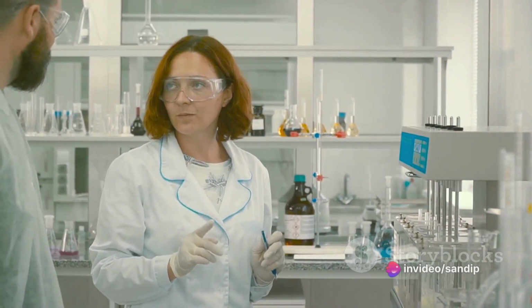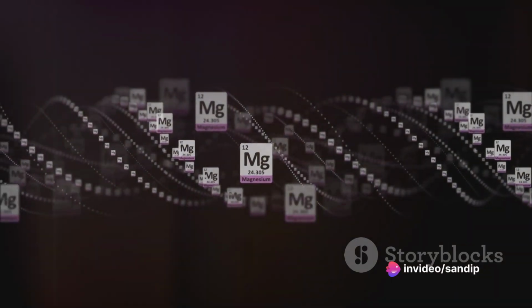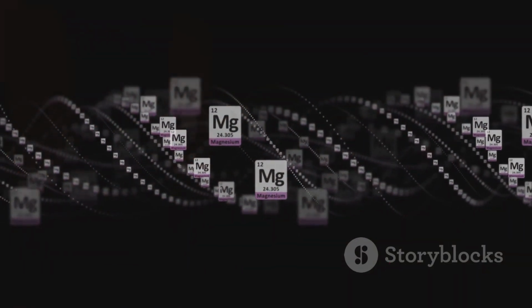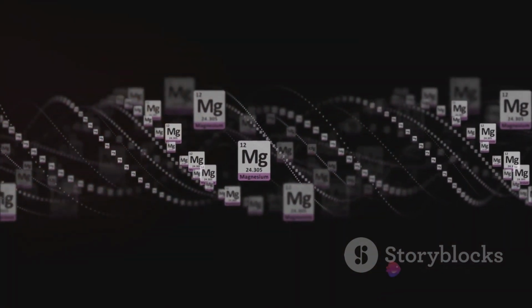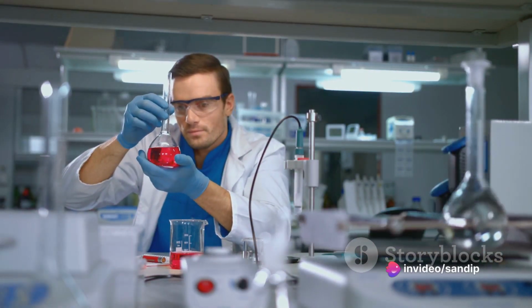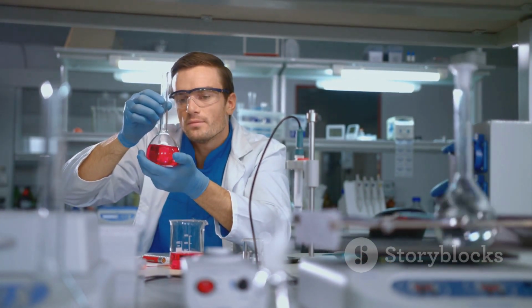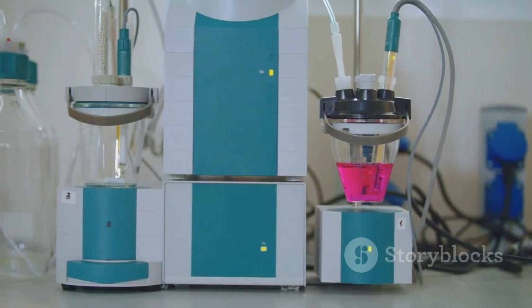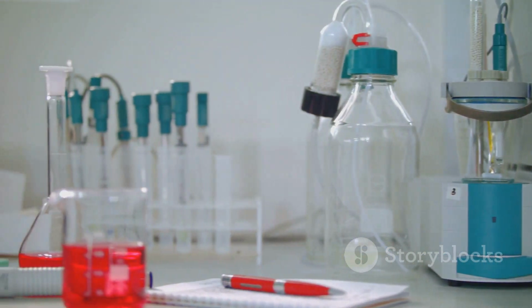To summarize, nuclear magnetic resonance spectroscopy is a powerful analytical tool that provides a wealth of information about the molecular world. It works by exploiting the magnetic properties of certain atomic nuclei, allowing them to absorb and re-emit electromagnetic radiation in a magnetic field. Not only can it identify different types of nuclei, but it can also reveal details about their chemical environment and their relative positions within a molecule. It's a key player in the field of analytical chemistry, and its applications are as diverse as the molecular world itself.